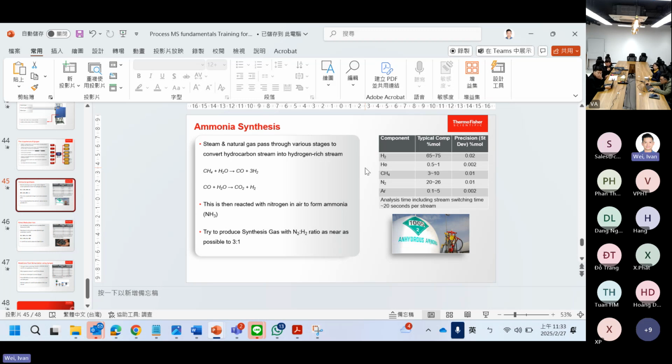Even though we can measure different gases, we need to understand what the components and different compounds are. It's not like an FTIR, which can do the whole screening. We need to understand if the compounds are fragmented or ionized, what they can break down into, and then we go back and figure out if this is suitable.